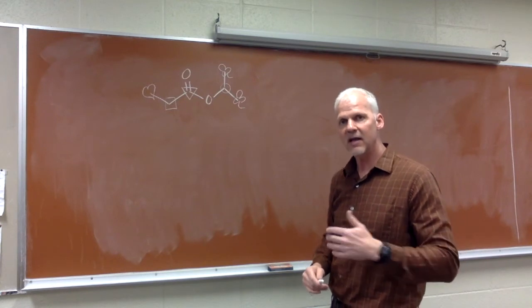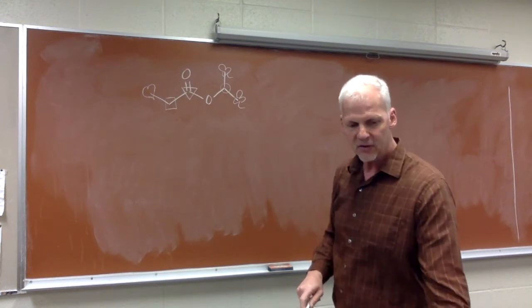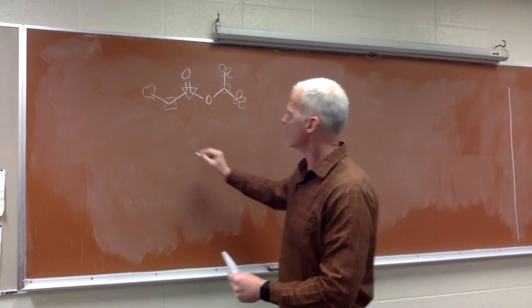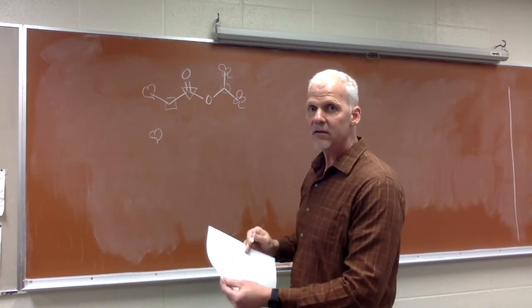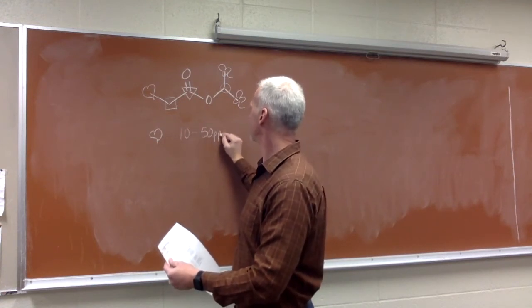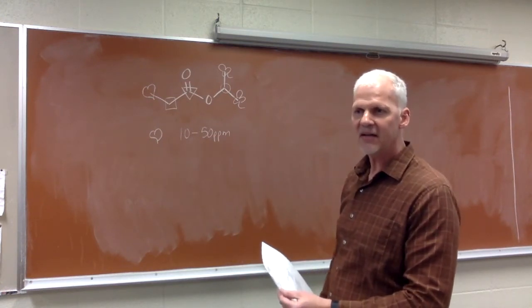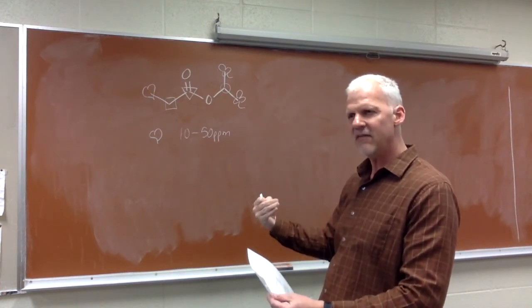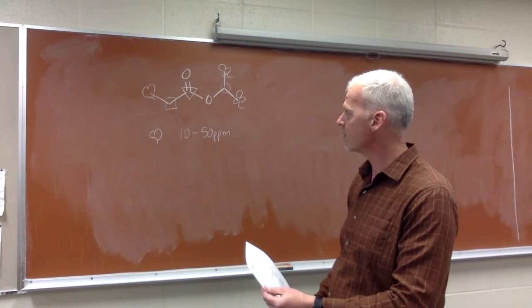The next thing we do then is look at the chemical shift. So where in that spectrum between 5 and 220 would these given signals occur? If you get out your data table, we can look at the different types of carbons here and identify what range they would be in. If we look at that first methyl group, the heart signal, that's going to fall into the aliphatic category. Aliphatic in the carbon-13 NMR runs from a range of about 10 to about 50 ppm. That methyl group is too far away from any fancy structural units to be affected. So this is where our signals start off, in that 10 to 50 range, and if they get shifted toward the end of that range or higher than that range, that's where they're next to something fancy or part of some functional group.